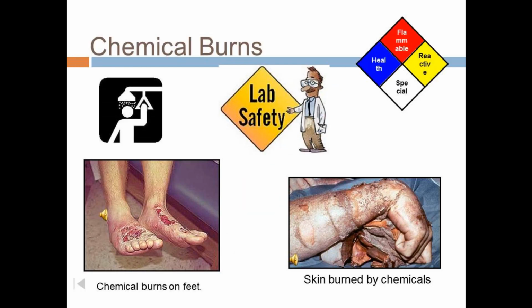So remember in the last video about chemical procedures and lab safety that we talked about how it is important to always add acid to water. So again, we're going to remind you that it is important to add the acid to the water, not the other way around, because you may end up with chemical burns.